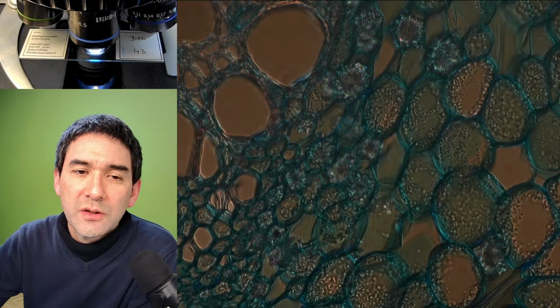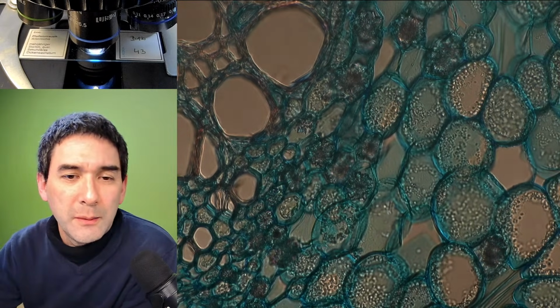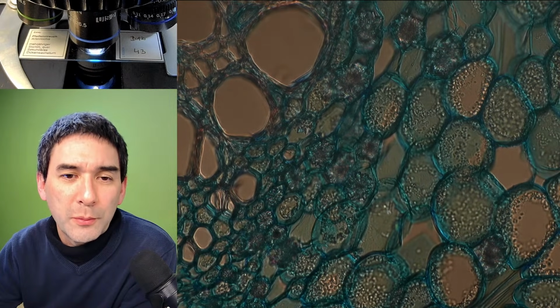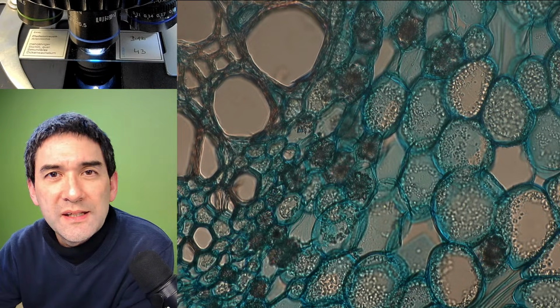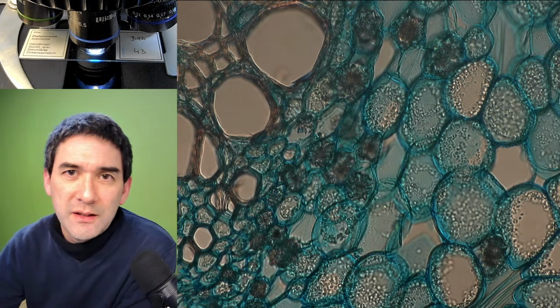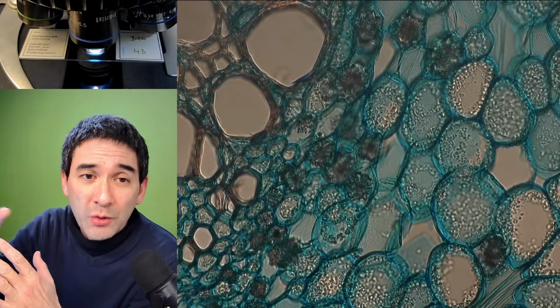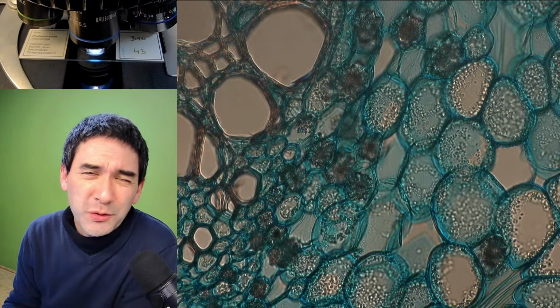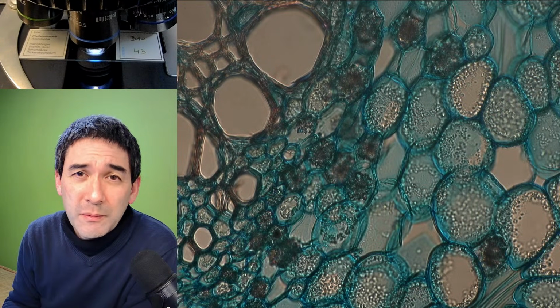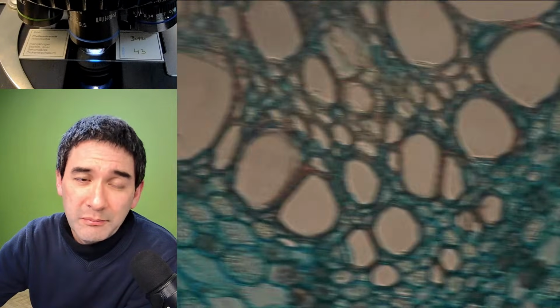So the thing is the following. Dust buildup is, of course, always a problem with microscopes. However, you will mostly only see the dust if it is close to the plane of focus, right? Or maybe on your eyepieces. Inside, if there's some dust, you wouldn't see it anyway because it's out of focus and blurry. So I would really not clean.